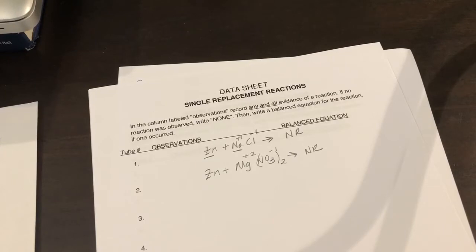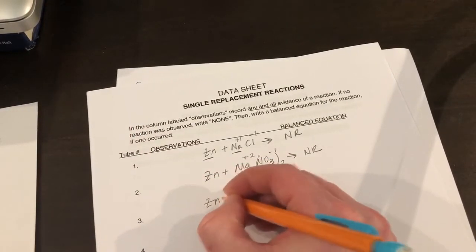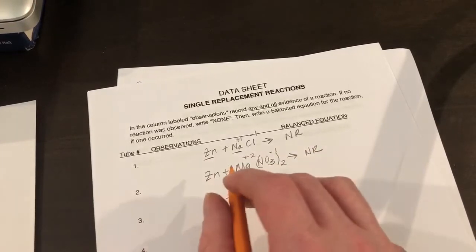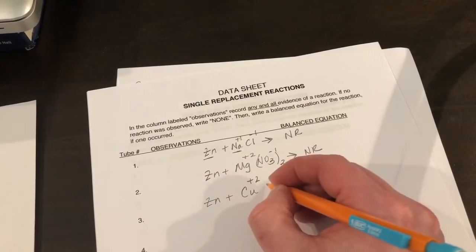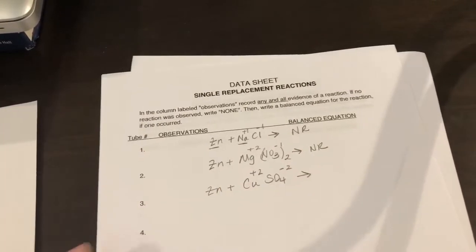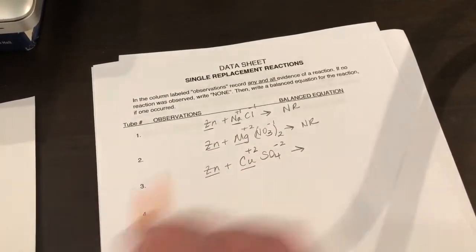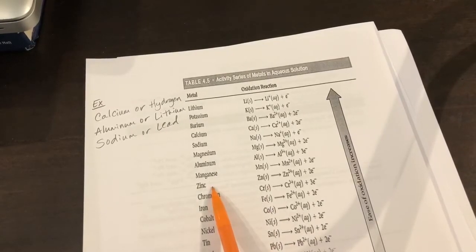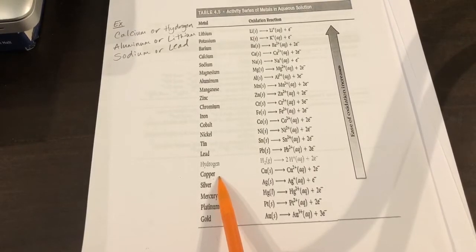Okay, let's look at number 3. It says we're going to react zinc with about 5 milliliters of copper 2 sulfate. Copper 2 is Cu with a +2 charge. Sulfate is SO4 with a -2 charge. No need to crisscross because they're equal and opposites. Now I'm going to consult my activity series, just like I did before. Is zinc higher up than copper? Well, zinc is right here, and copper is down here. So it will replace it.